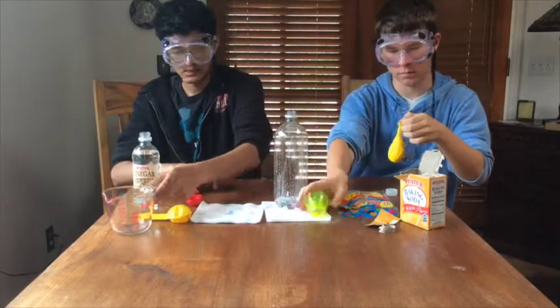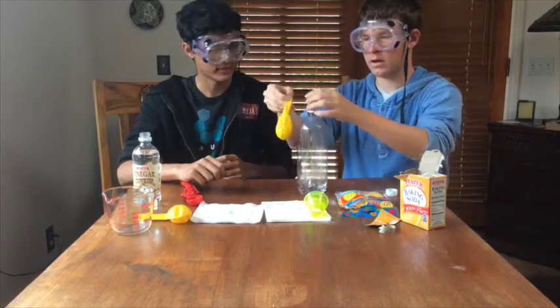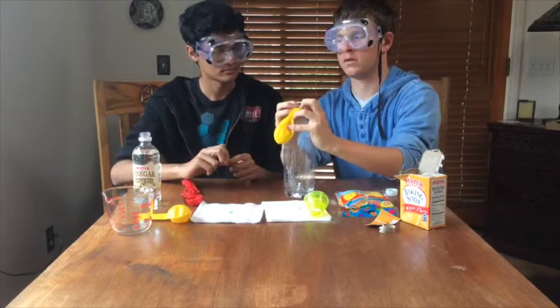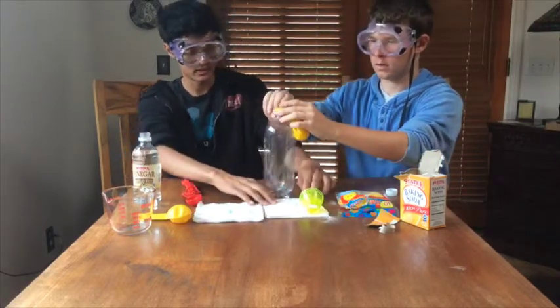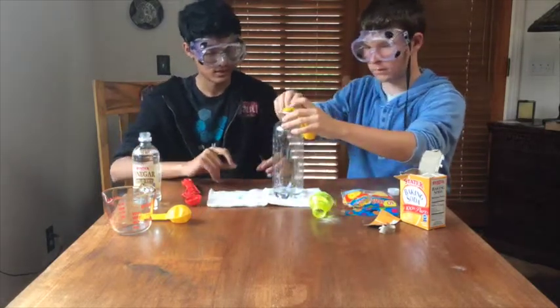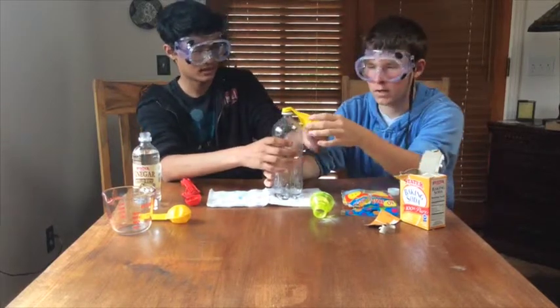So now we put the balloon over the surface of the bottle. And make sure this is centrally located. Yep, and we want to make sure it's over our towels. Yeah. And you want to make sure you hold it up because otherwise it's going to fall.